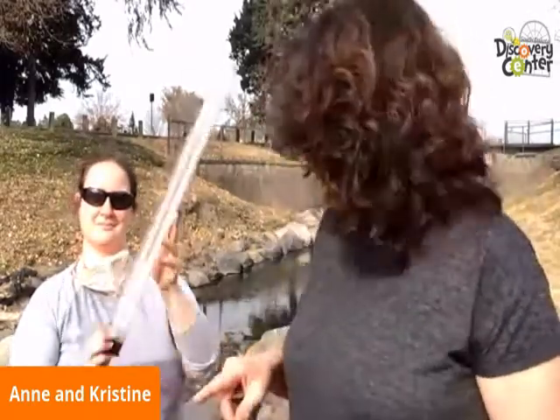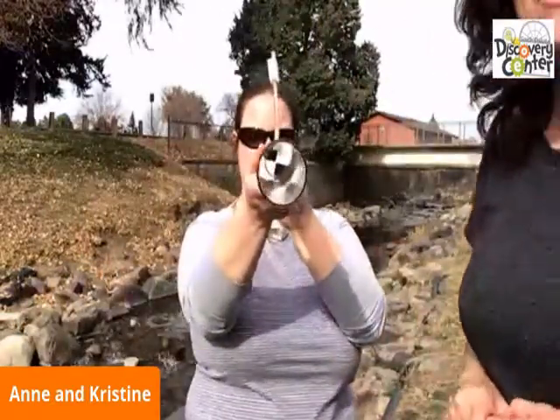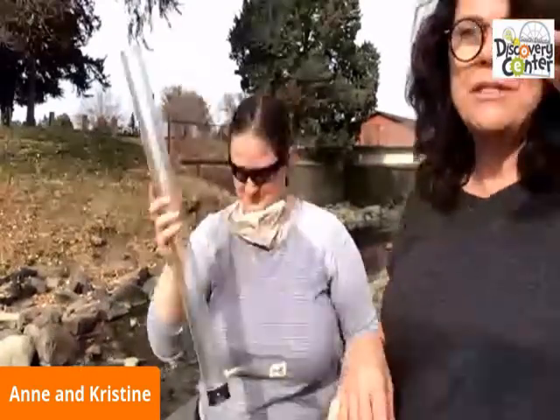Going on with our T-tube, we have this shunt, this at the bottom with a clip. And that's going to drain the T-tube for us. And then at the very bottom of the tube is this black and white pattern called a Secchi pattern. And when that goes from disappearing to appearing, that's how we're going to be able to make a measurement.